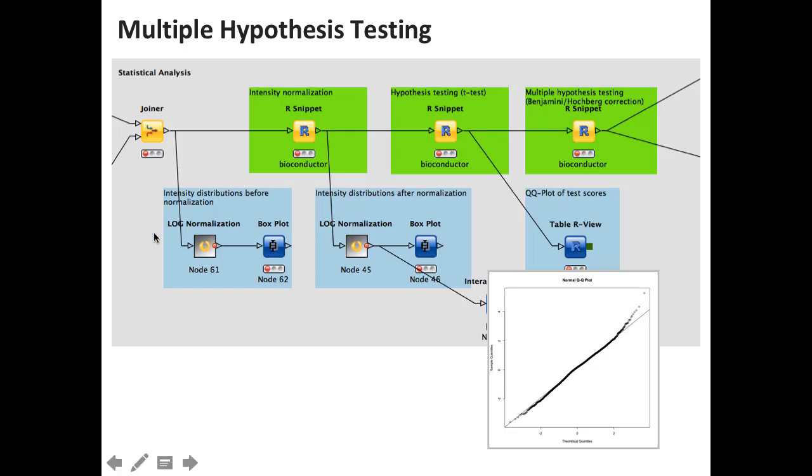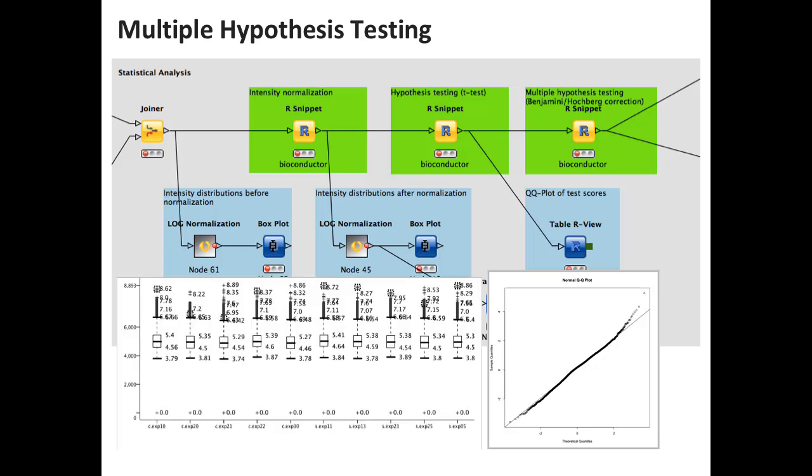And in KNIME, you can now hook up plots to all of these steps so that you can actually do some sanity checks in all the steps as you go along and get plots out of that. You can construct the box plots for these. So this here looks at the various samples and tells you that indeed the normalization worked well. You have an intensity distribution that is even across all samples, so that gives you a warm, nice feeling that you got it right. And then you end up with few things that you need to identify.